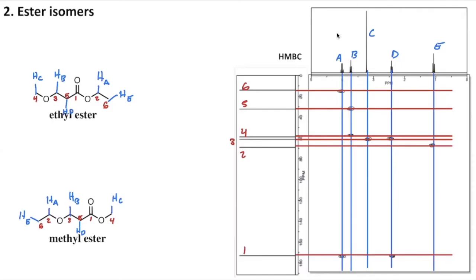So I'm going to fill these correlations in here, wherever I can fit them. And then when we've got those correlations in, maybe we can get rid of some of these lines to help visually calm it down a little bit more, because it is a lot and I think it's going to even overwhelm me a little bit. So just use these lines as a guide to get your correlations and focus in on what the correlations mean and not focus too much on all of the crazy lines that we've just drawn.